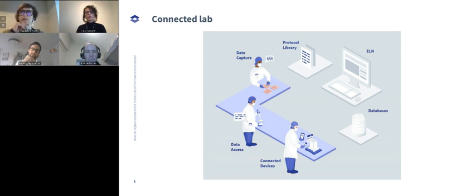I think many organizations we work with have already data lakes, ingestion initiatives in place. But still, adding context and metadata to that data lake is often either missing or a challenge. And the missing context today still most often comes from the user, from the technician or the scientist that works in between these different islands of data, from equipment that he or she might be using while handling different experiments, or from the environment itself, being the laboratory, either the temperature, humidity, things like this.